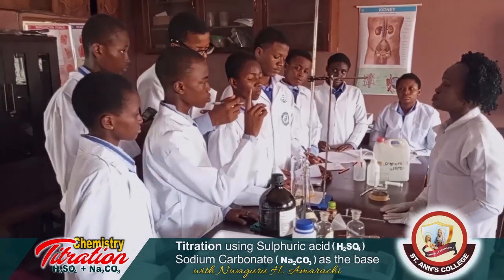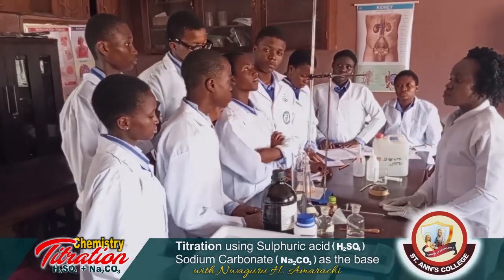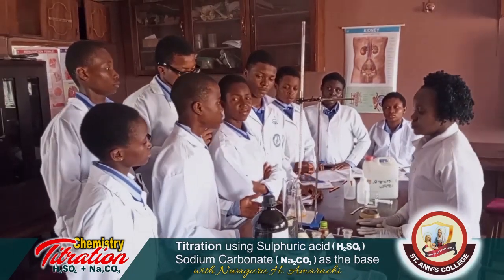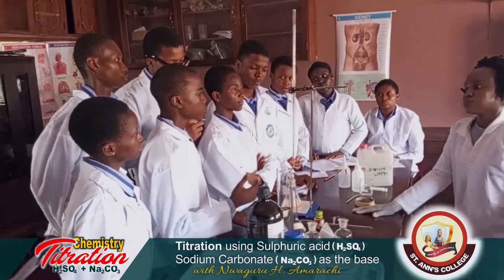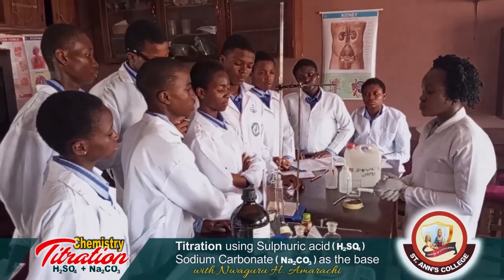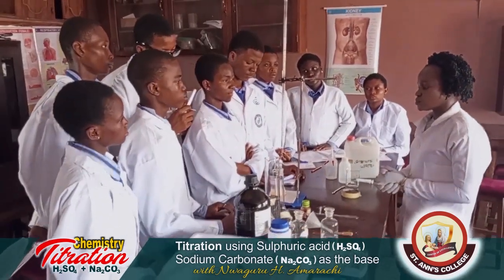Any other question? I have a question. Teacher, please, when we are doing the titration experiments, can you tell us the necessary and possible precautions we need to undergo so as to attain the correct readings?